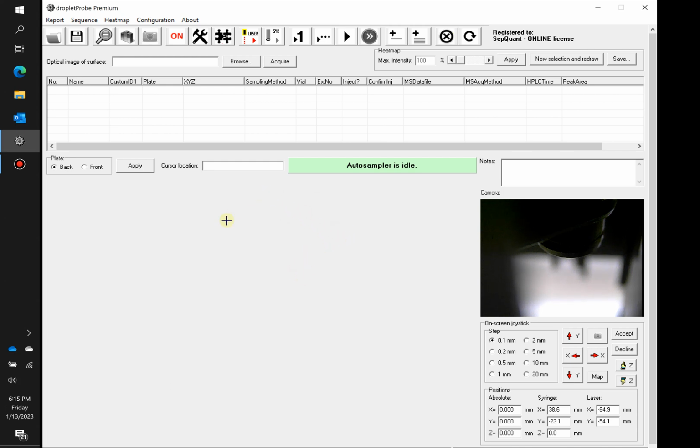I'm also going to go into the calibration of the system a little bit later. This is basically going to assume that it's already been calibrated and there's nothing off-putting about that, and I just don't want to spend a lot of time on the calibration. There is a full auto calibration. It's straightforward, easy to use. And there's some tricks on it, and I can spend a lot of time just on the calibration. So I'm going to breeze over that and go right into it.